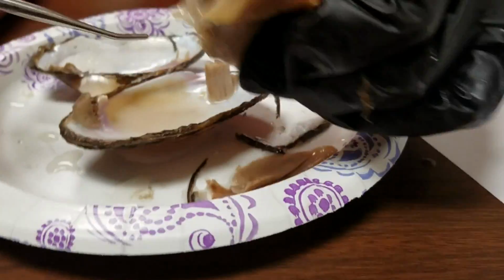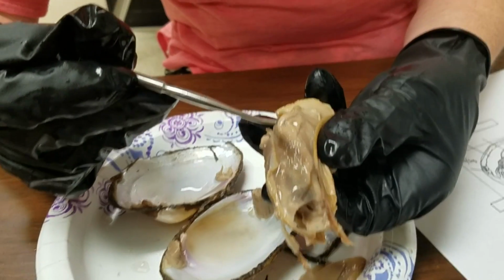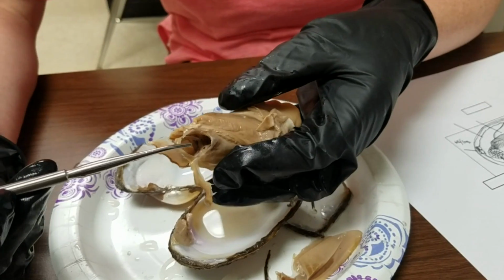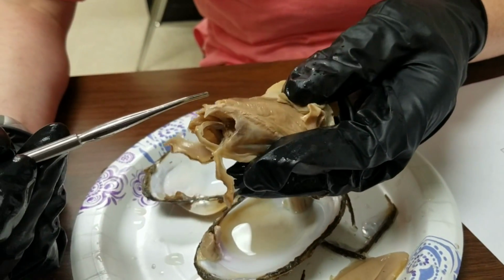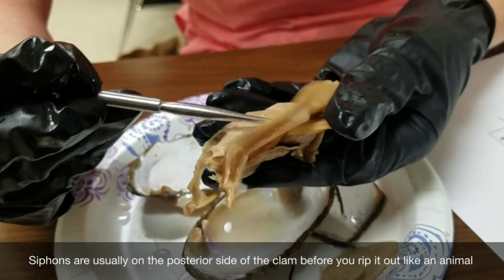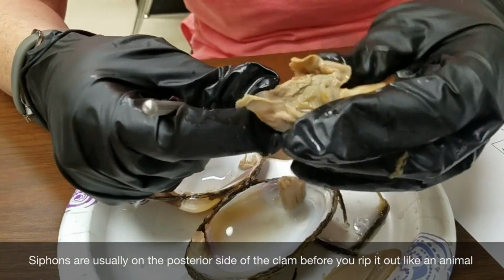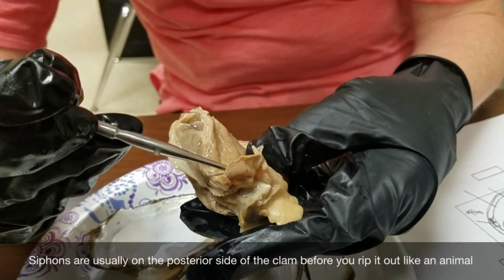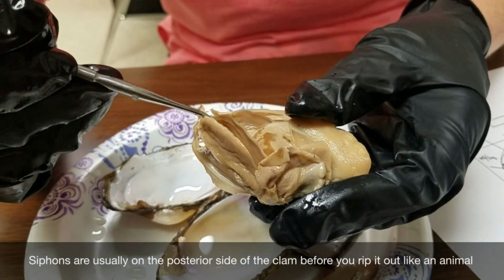And then it asks you to find siphons. I think my siphons might have gotten torn, but the clam is going to have siphons on an edge of it, if you can find them. They'll look like two little tubes, but I'm not seeing any siphons on my clam here. I think they might have gotten a little torn up.